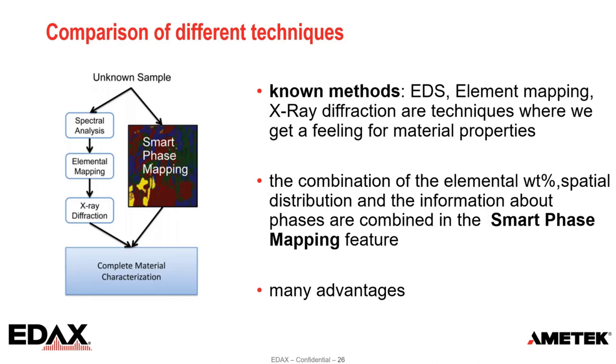The nature of the sample is preserved. Since a simultaneous recording of phases and quantitative results is obtained, the content of the information obtained is therefore high. In addition to the respective element maps, the counts per second maps are also recorded, which play a major role in the representation of the topographical effects and provide another source of information.